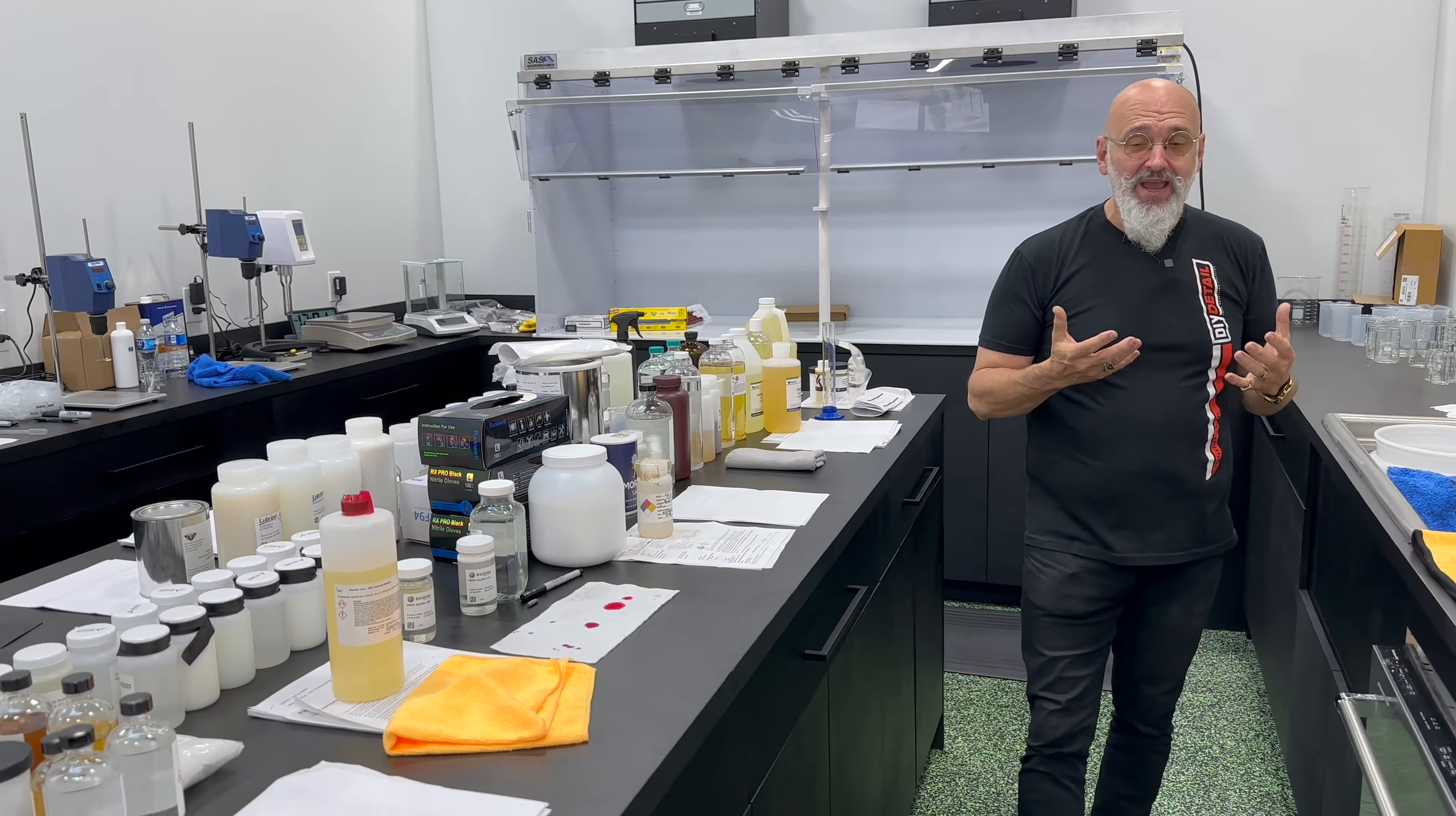So this is just a quick tour of a lab, how things work. You can see just some of the chemicals that are out here for doing testing. There's a lot more involved to it than that. And we'll take you to the next room where a lot of the cool test equipment is to see how these things actually work.